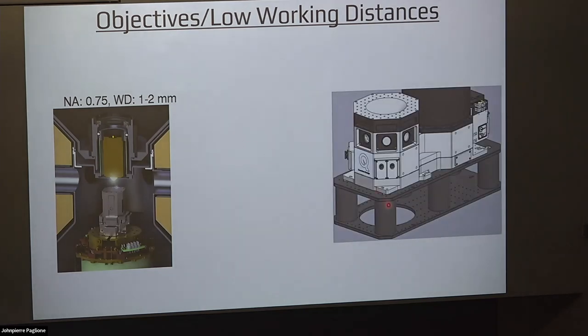And of course, we have a special standoff if you want access to that bottom port. Not everybody has an optical table with a hole through it, so we can do something like this so you can get access. Some experiments want to go vertically through the magnet.